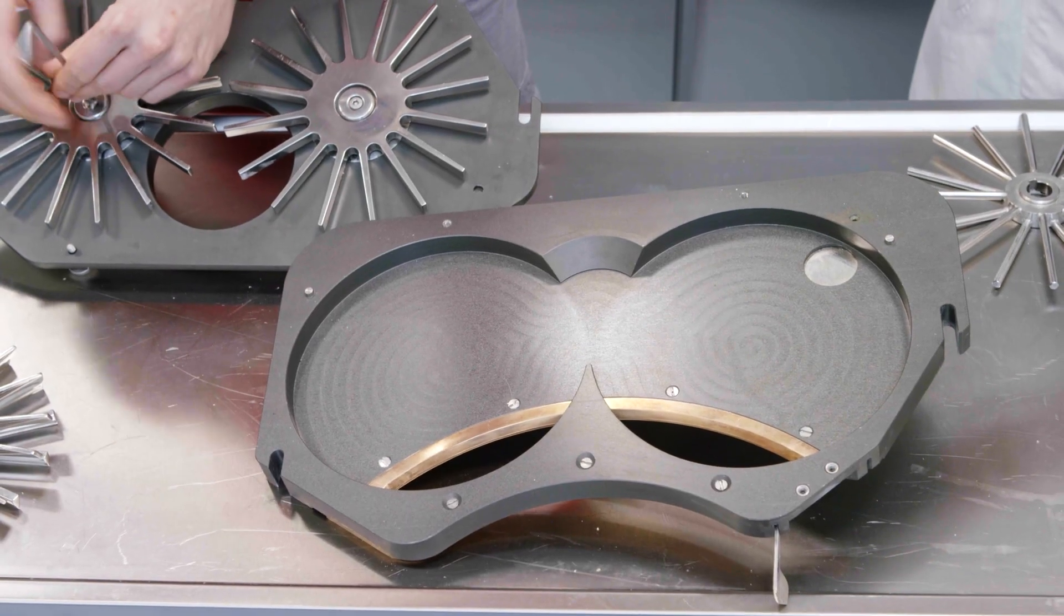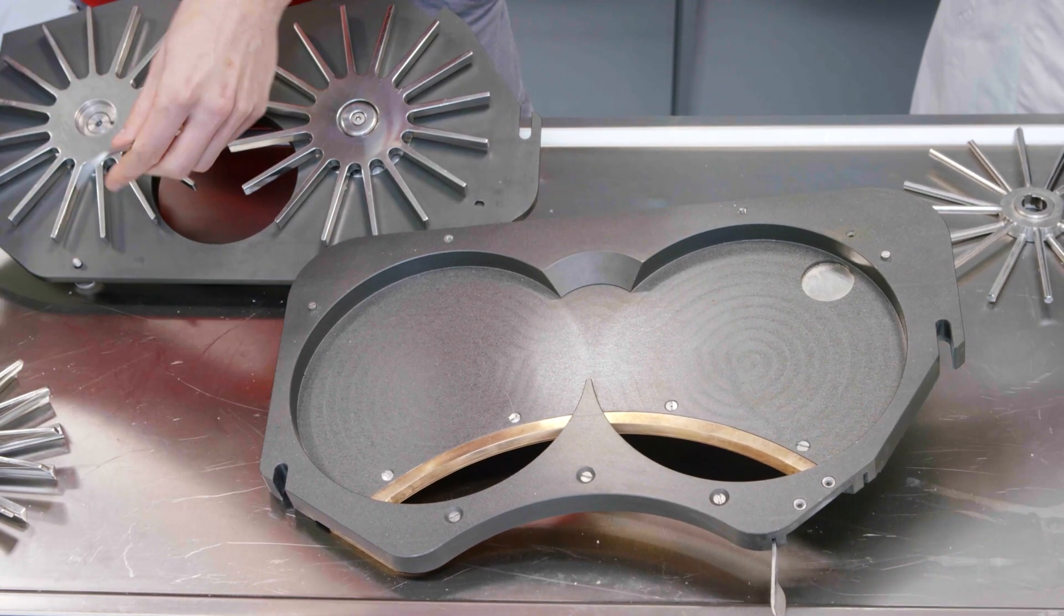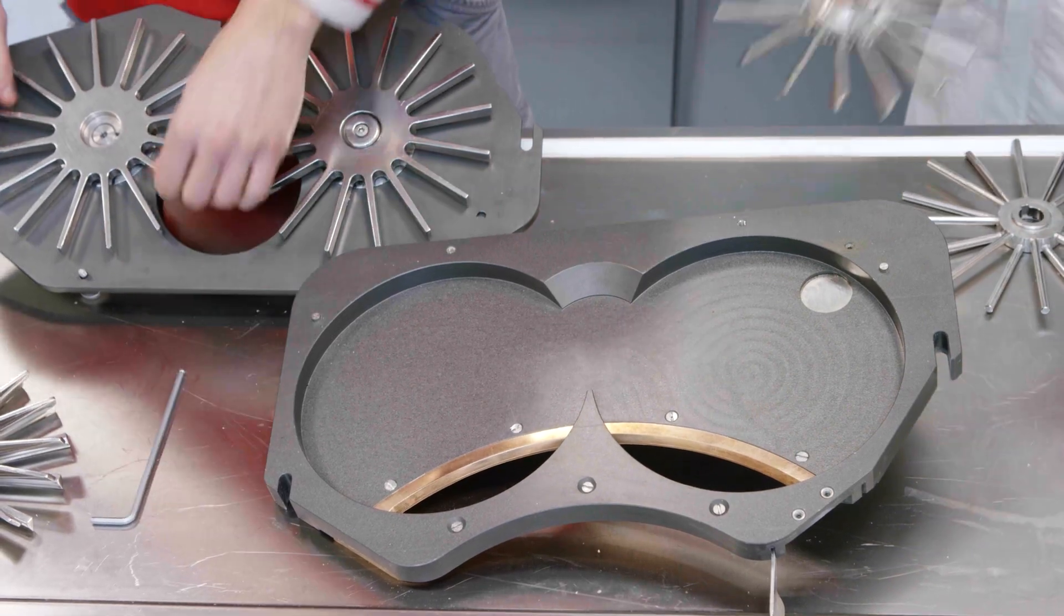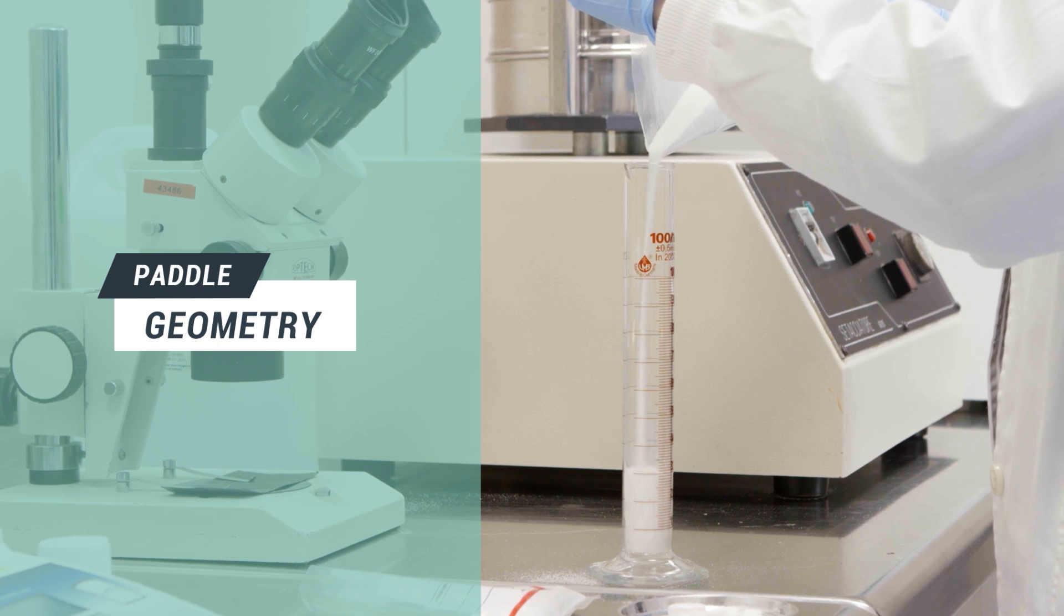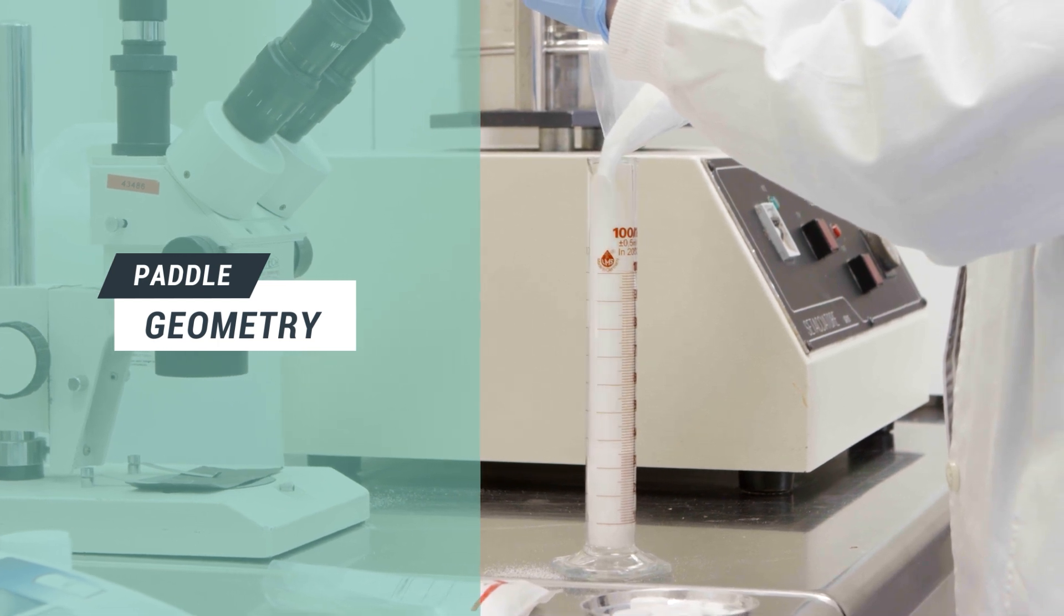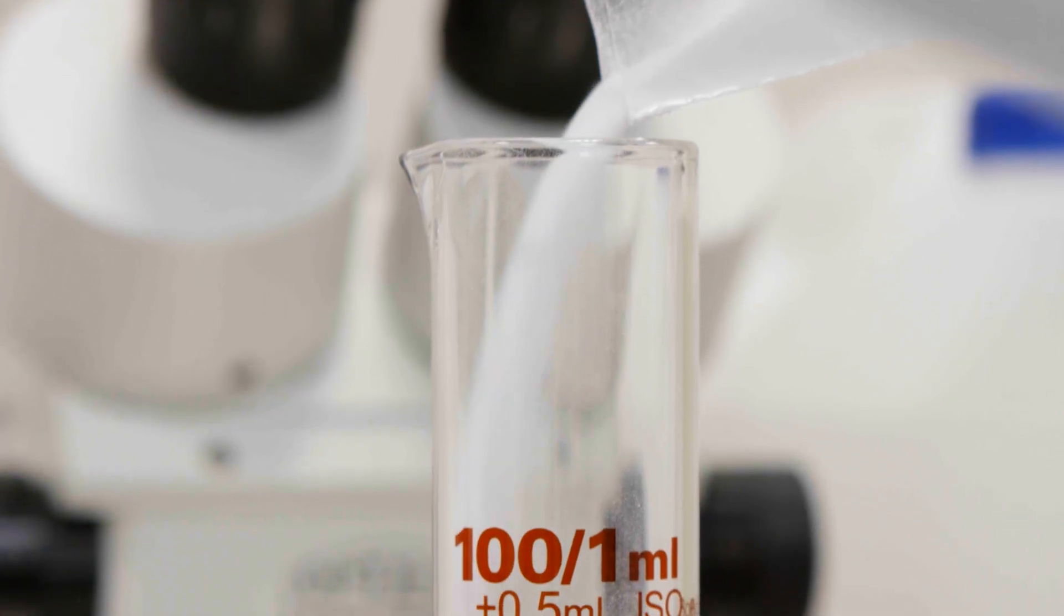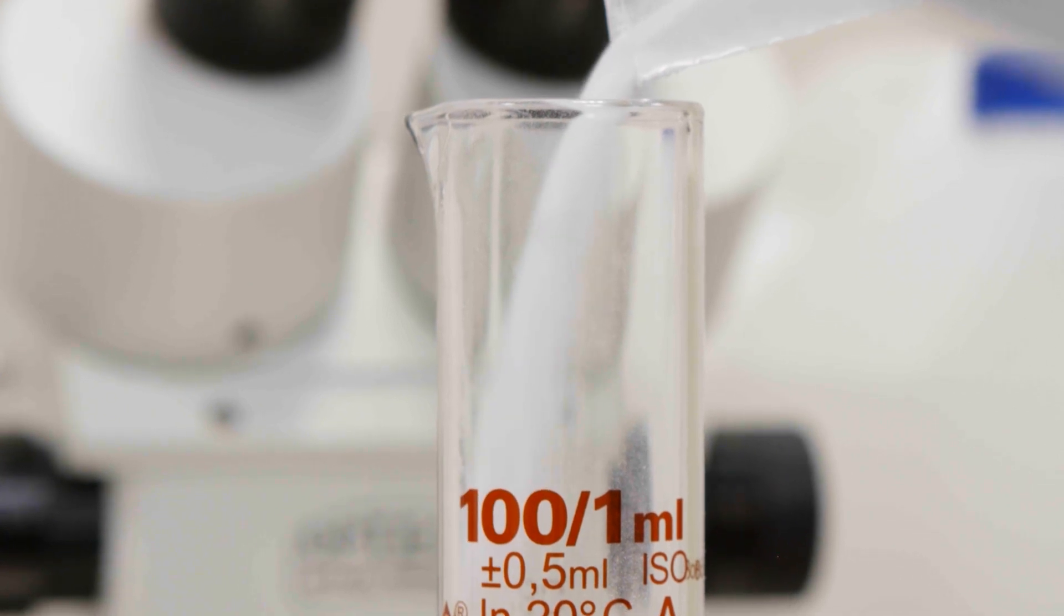Choosing the right paddle shape is therefore important. For example, with a lactose monohydrate based powder with very poor flowability, I succeeded in reducing a relative standard deviation on tablet weight from 1.5 percent to 0.3 percent simply by changing the paddle geometry.